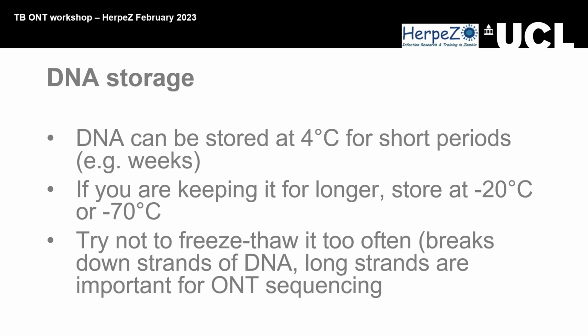on each flow cell. We've done quite a lot of Gram-negative sequencing with various student projects, and we worked out that the whole way through doing the extraction kit, the sequencing preparation and the flow cell, if you're putting, say, 24 samples on, the cost actually comes down to quite reasonable. It's something like $40 to $60 per whole genome. So if we can get this extraction technique to work better, then we might be able to get it down as well, which is really important, because people aren't going to want to roll it out if it's prohibitively expensive.